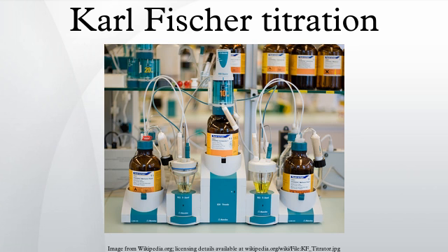The titration cell also consists of a smaller compartment with a cathode immersed in the anode solution of the main compartment. The two compartments are separated by an ion-permeable membrane. The anode generates I2 when current is provided through the electric circuit. The net reaction, as shown below, is oxidation of SO2 by I2.